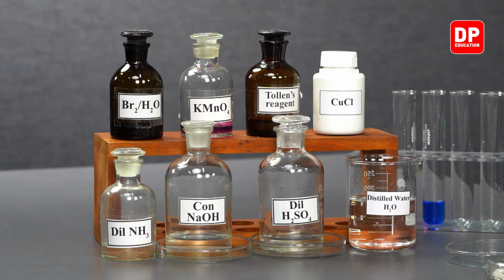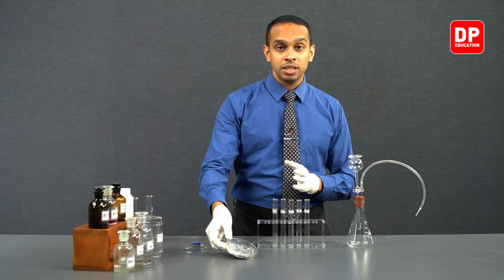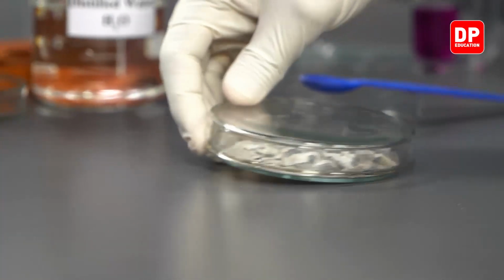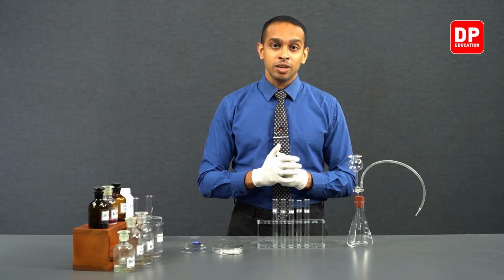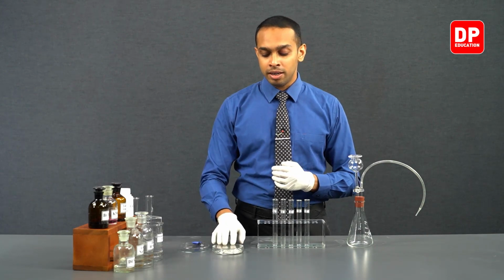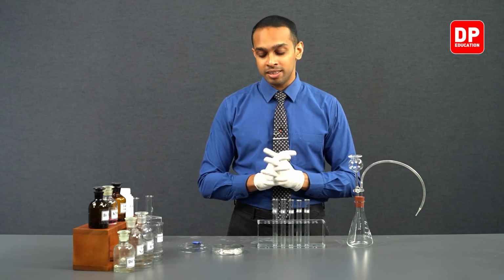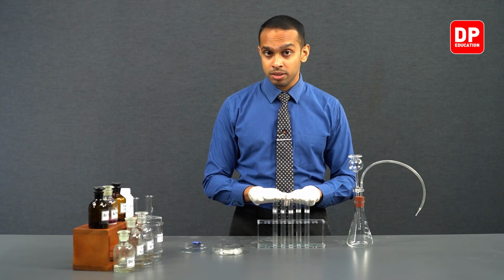Apart from these reagents, we have calcium carbide, which is a gray color solid, right? So normally students, calcium carbide wouldn't have this gray color if it is pure calcium carbide. However, when we obtain calcium carbide in our labs, it could have this gray color. Otherwise, it is going to be colorless or white in color. Apart from that, we have our labeled test tubes.